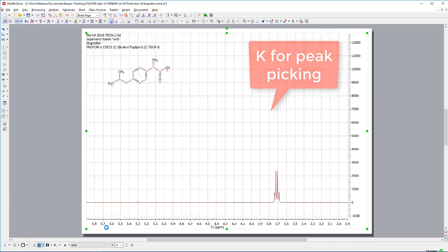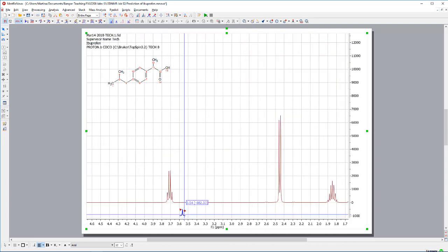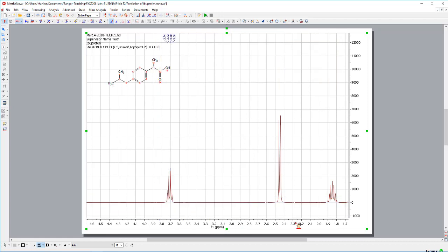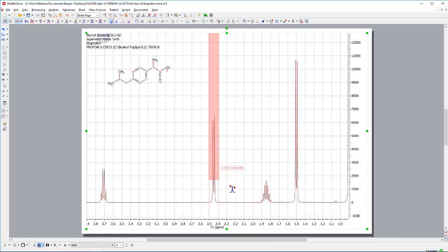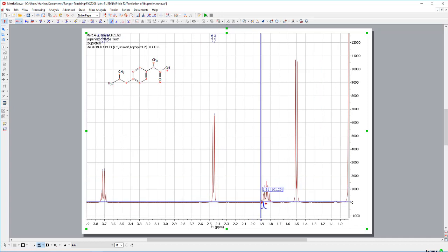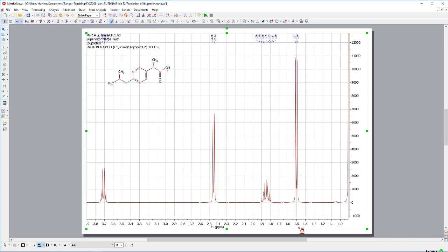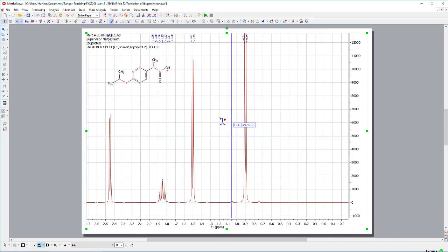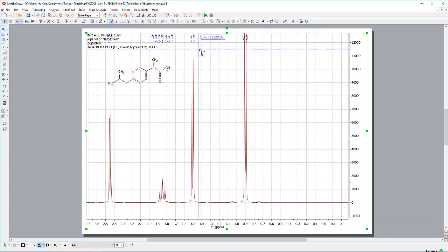Either we move the spectrum now here along. We can do this because we have quite a number of signals here in the range. And I pick one signal after the other one. They are quite isolated. So, there is no signal overlap that makes life really easy.